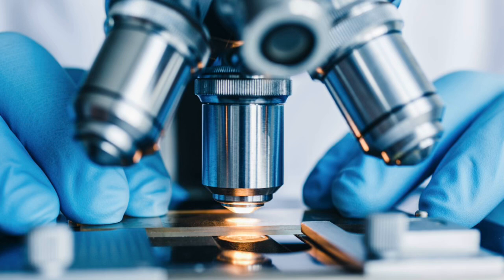Finally, microscopes use coarse and fine focus knobs. A coarse focus brings the image into general clarity, while the fine focus allows precise adjustments. In forensic science, clarity is critical. A poorly focused image could lead to a misinterpretation or missed evidence. All these parts work together to produce a clear, reliable image that investigators can analyze with confidence.